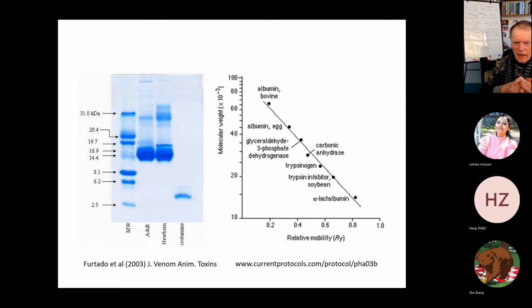And also, there are two other things you need to take into consideration when using this technique for proteins. Some proteins already have a very high charge, and one example is histones. Histones are used in eukaryotes as a way of compacting the DNA. They have very high positive charges to compact the negatively charged DNA.